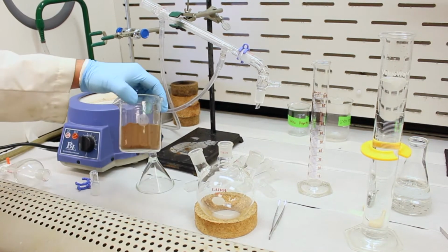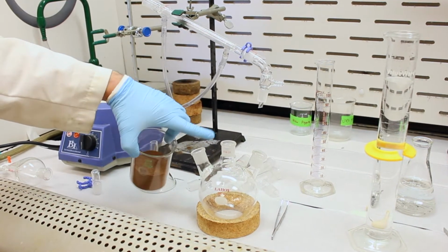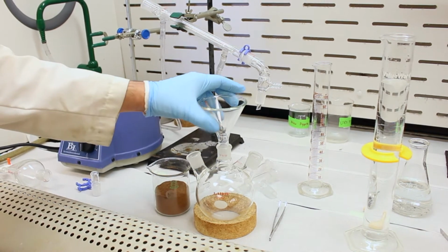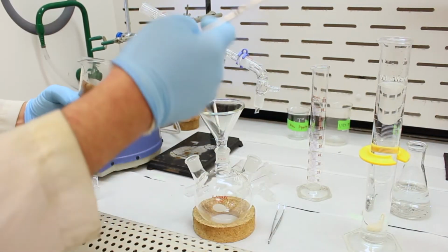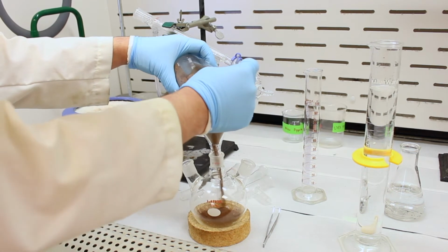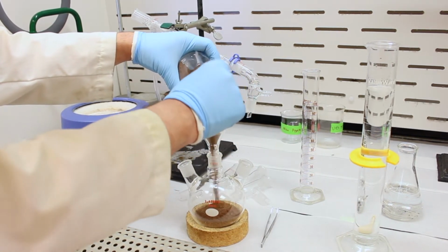Alright, so we have our 60 grams of allspice here, which contains our eugenol, and we need to add it to this flask, which is our boiling flask. So we'll take a powder funnel, just stick it in there, and dump in the allspice. Now this process can be a little tricky because the allspice is fine, but with the spatula, we can get it all in. So scrape, scrape, scrape.